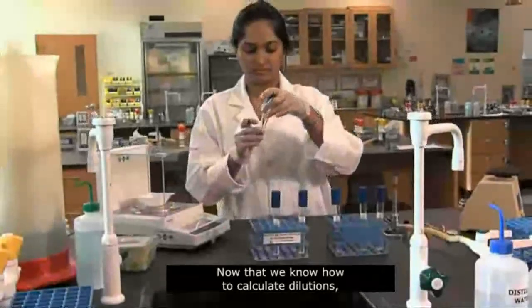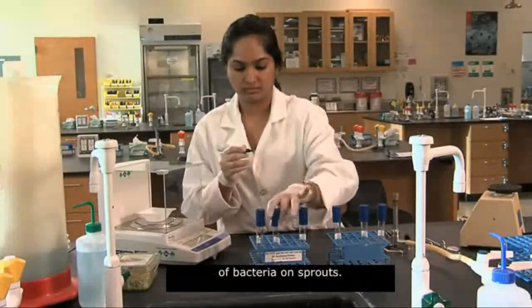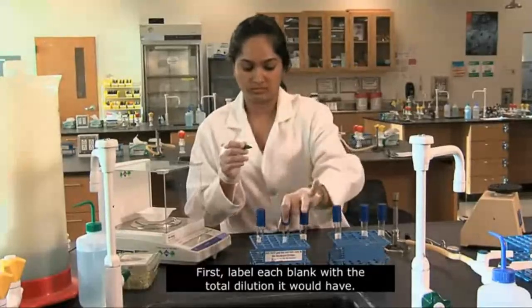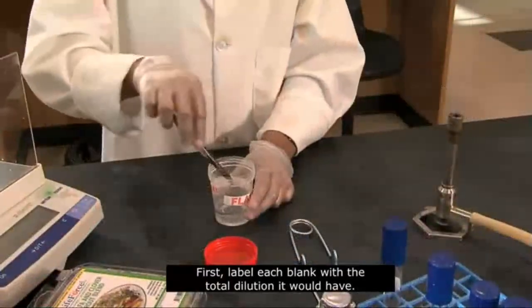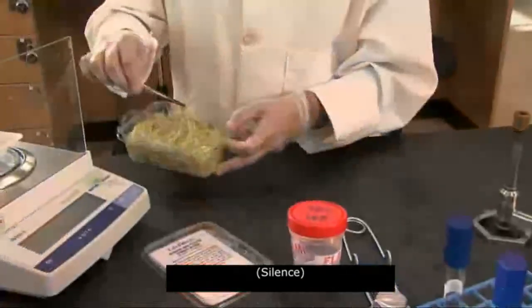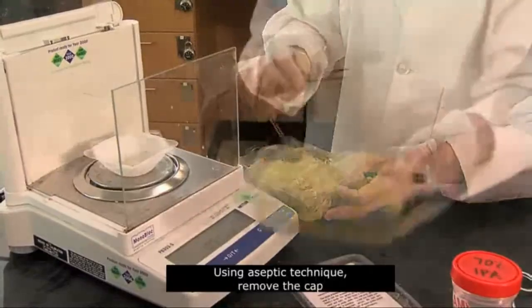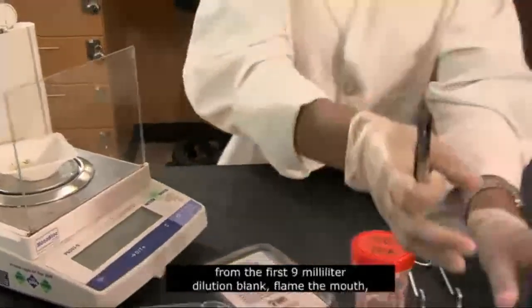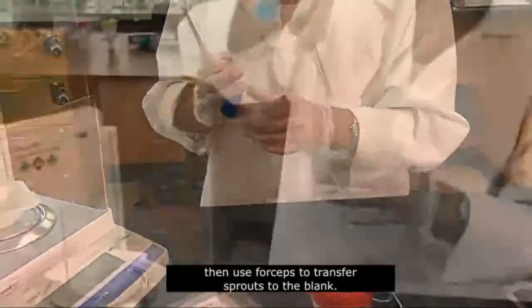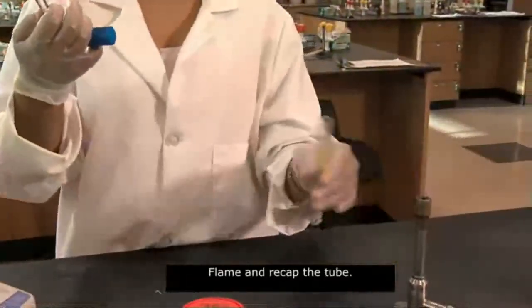Now that we know how to calculate dilutions, let's use our serial dilution method to estimate the number of bacteria on sprouts. First, label each blank with the total dilution it would have. Aseptically weigh 1 gram of sprouts. Using aseptic technique, remove the cap from the first 9 milliliter dilution blank, flame the mouth, then use forceps to transfer sprouts to the blank. Flame and recap the tube.